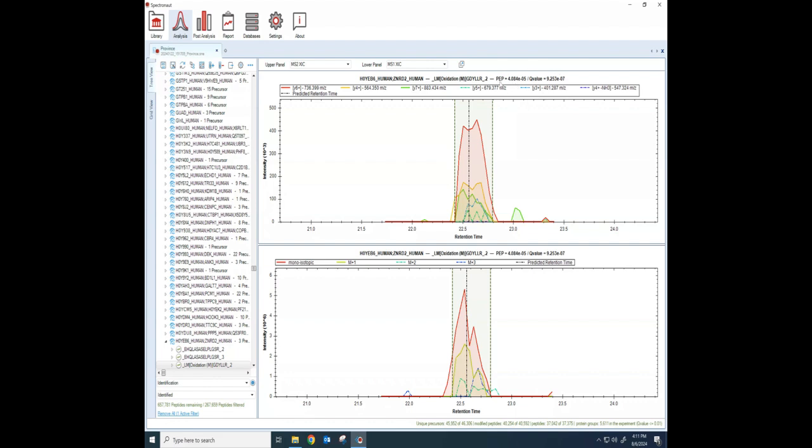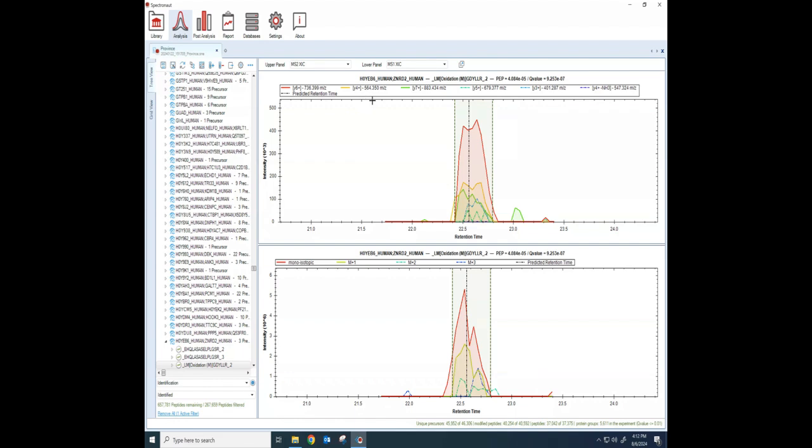It tells me what protein this peptide came from. And then it tells me the actual sequence. So this actually has a methionine that's been oxidated here. And it is a plus two charge is what that dot two means. It gives me a PEP score and a Q value. And those things, as you'll notice, as you go through, they will tell you something about the quality of the spectra that we have here.